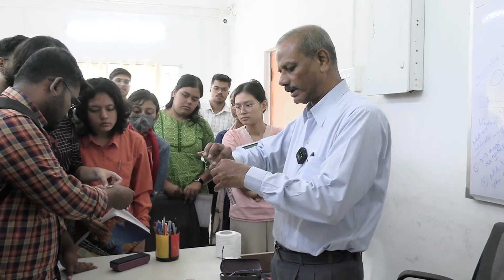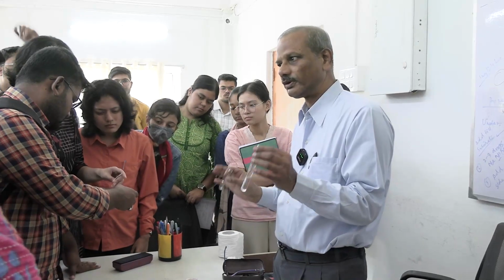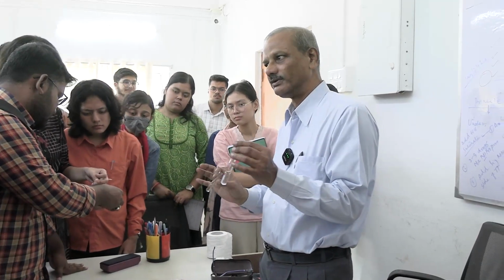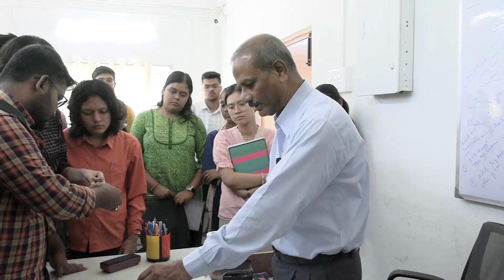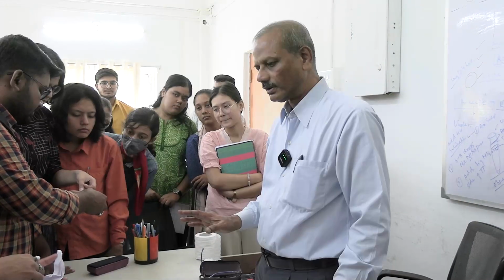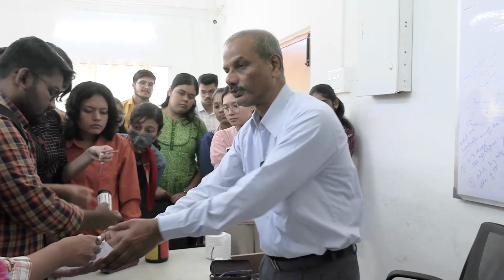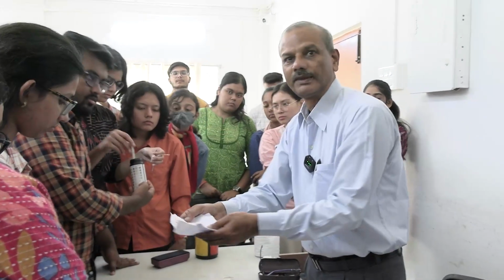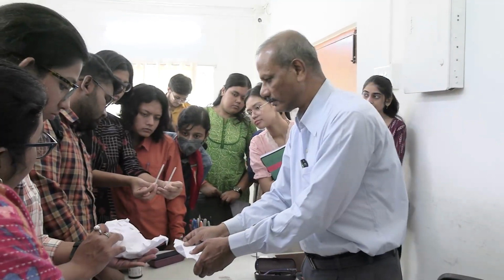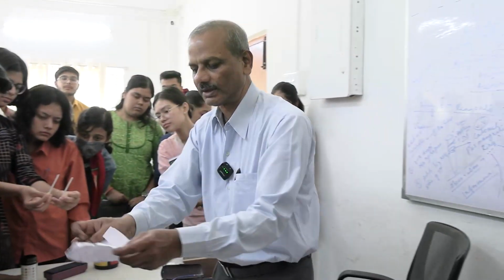Similarly, as I told you, for polysaccharides you will not get a positive result. Sucrose in pure form will not give a positive result. Lactose you will get a positive result. Somebody should open it. This is sucrose, that means it is the pure form of sucrose, brought from the laboratory. This is lactose. You see the difference? It is dust-like powder.